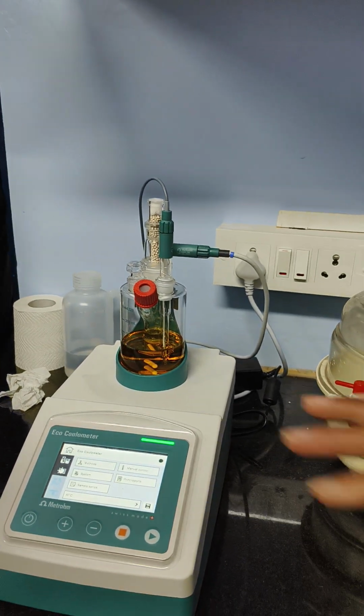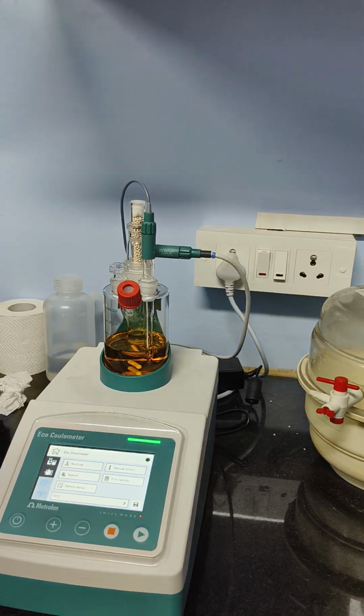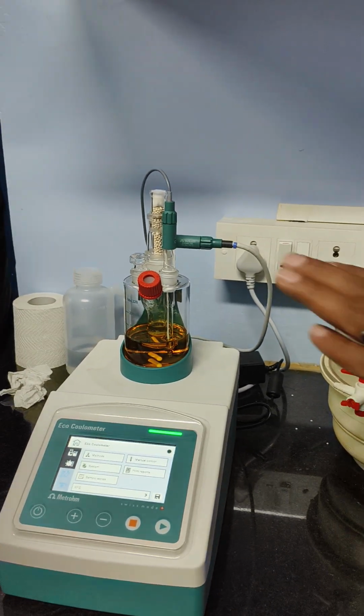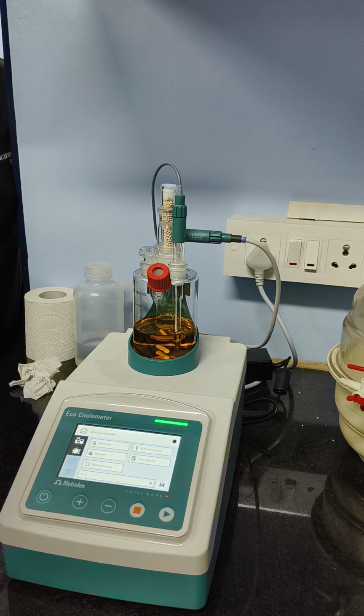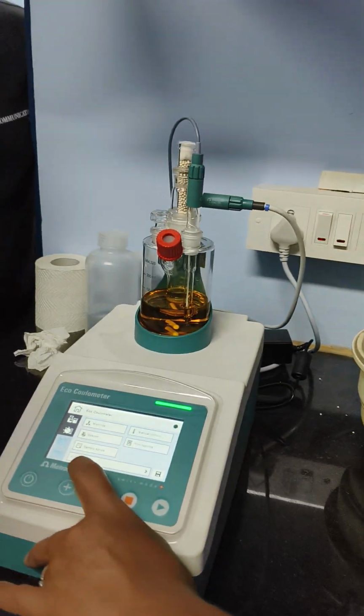Now the basic thing I did: it has only one method, there is no different method. The default method is already available. I just did a little bit of modification here and there, and then I stored the method. The method name is KFC, Karl Fischer coulometry.